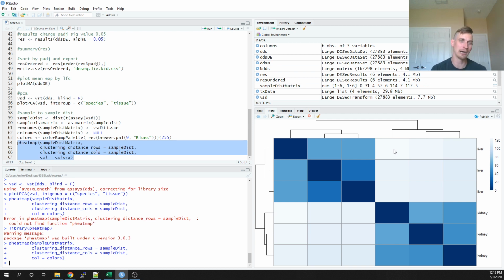So how this is drawn out is that the dark blue numbers are very small numbers. The darkest blue is a 0, and the lightest blue are big numbers. So this scale ranges from really, really similar to very, very different. This is something that you see semi-frequently in heatmap plots. Heatmap plots are samples directly compared to each other, or expression values compared exactly to each other.